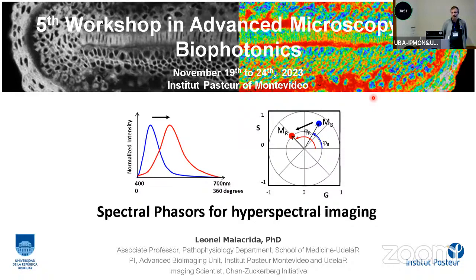Okay, so I started working with spectral phasor during my PhD, and at that time, Enrico told me, "Well, Leonel, why are you not doing phasors in Uruguay?" I said, "Well, no, Enrico, I don't have a FLIM box. I don't have all the technology." He said, "No, yes, you have everything. The only thing that you need is a microscope that can do a spectra." I said, "What is that?"